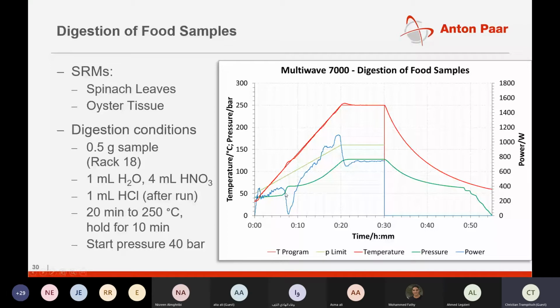The pressure is increasing. We also see an increase in temperature. What is the microwave doing? It immediately reduces the microwave power and then gently heats again. So everything is under control. We don't know which vial has reacted, but we know that all the vials get the same temperature, and the instrument is controlling everything so that we go up to the desired temperature, hold it there, and after the run, we cool down.